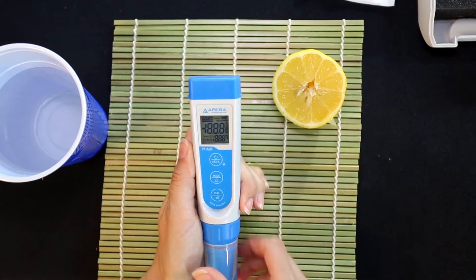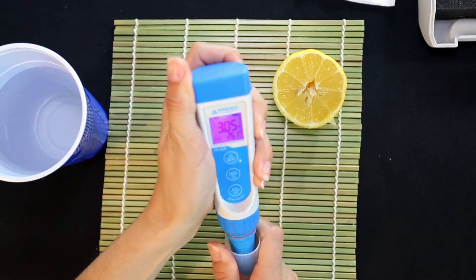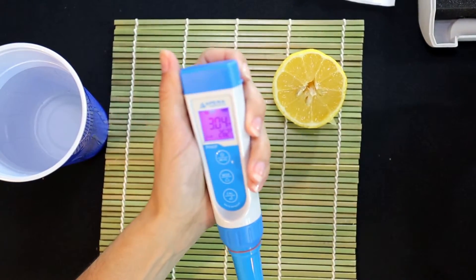Short press the power button to turn on the tester. Clean the probe with distilled water and dry it with a tissue.